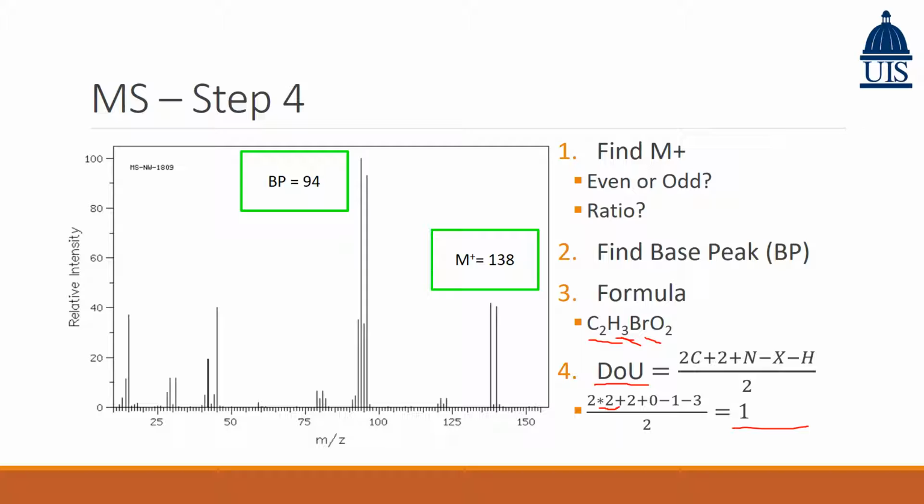carbon ring group. And as we can remember, we're pretty sure that there is a carboxylic acid, and as we know, the carboxylic acid has a double bond. So this makes sense in the context: we're getting a number of 1 here, we have 1 double bond here, starting to get the pieces together.